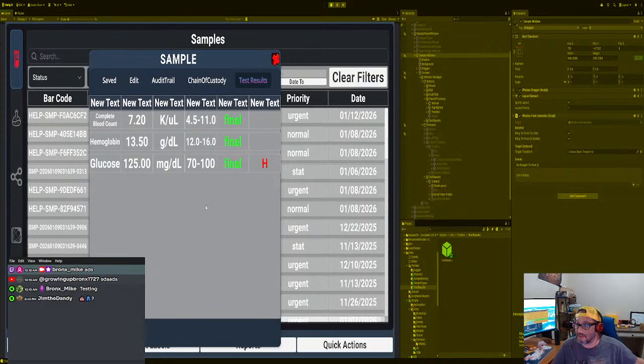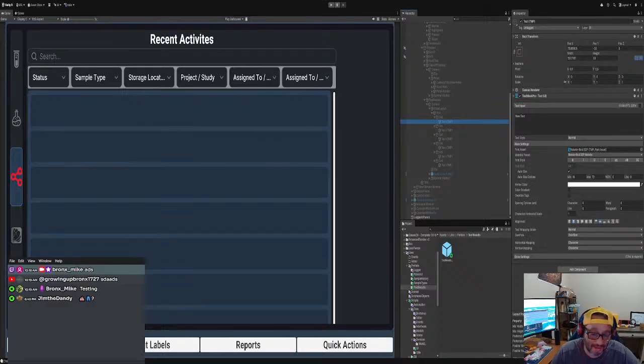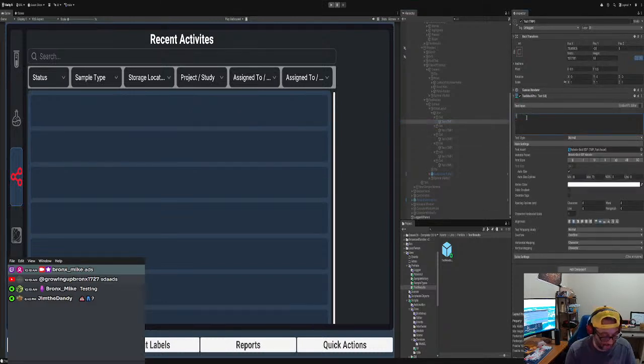All right, and as you can see here, we didn't name the columns, so we don't know what is going on. I forgot to name the columns. All right, let's name the columns. Okay, so column number 1 is test name, test name, right? And then we have results. Go here, results. I'm sorry, I don't want to cover you guys up. Results, right? So I'm naming the columns results, right?